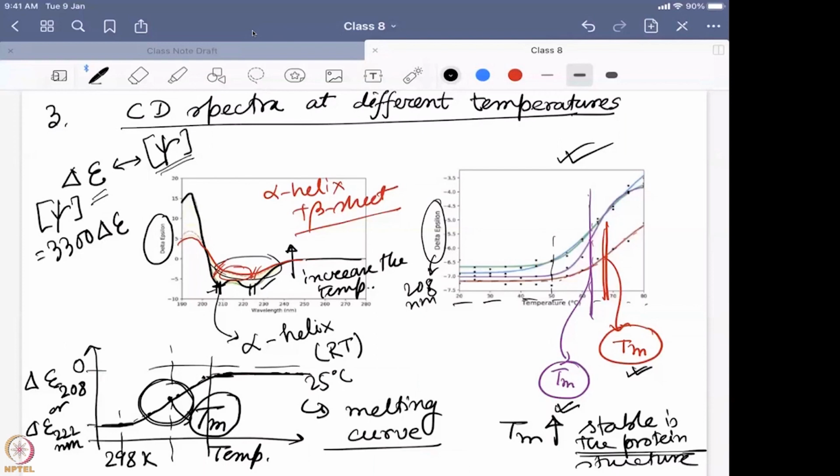At what point of time we start degrading our protein? At what point of time we'll probably die even? So for example, if someone is getting a heat stroke, what happens actually at that point? So for that, if we want to know actually which protein is probably getting affected much, to find out a solution for heat stroke or find out a condition where human can probably still survive. So we want to know actually which particular temperature the proteins are getting degraded.